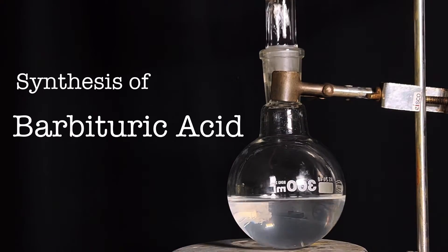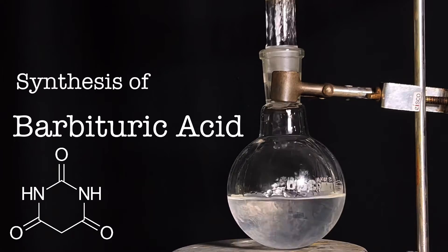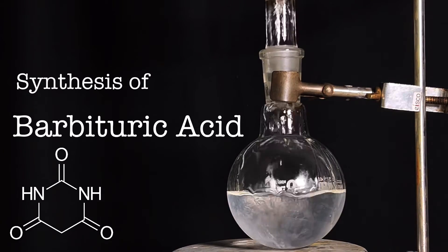Hello friends, in this video we will be synthesizing barbituric acid using urea and diethyl malonate.